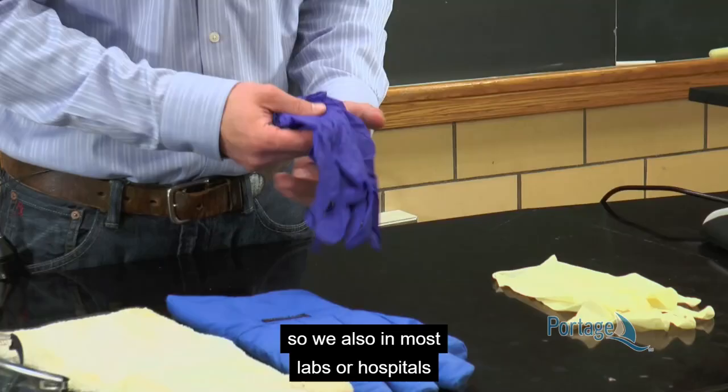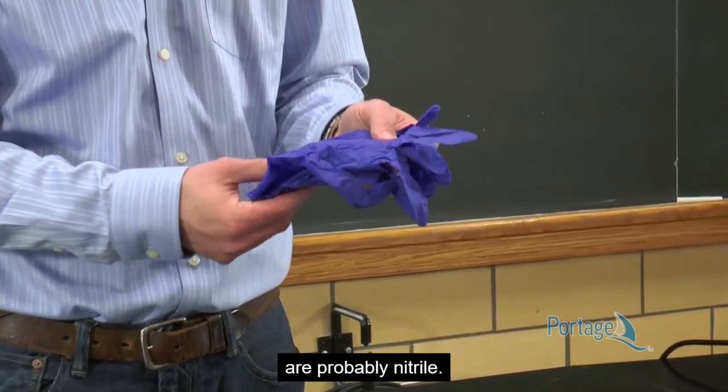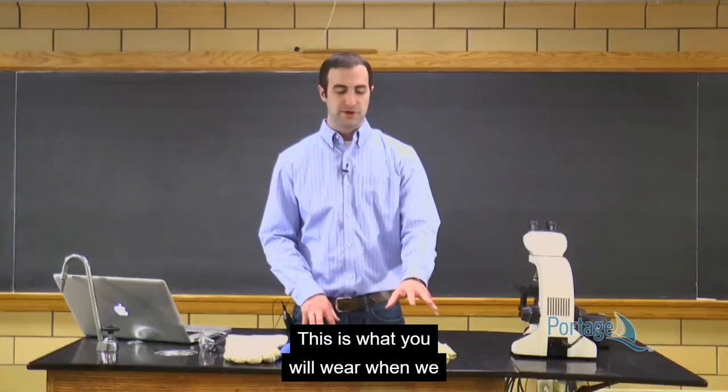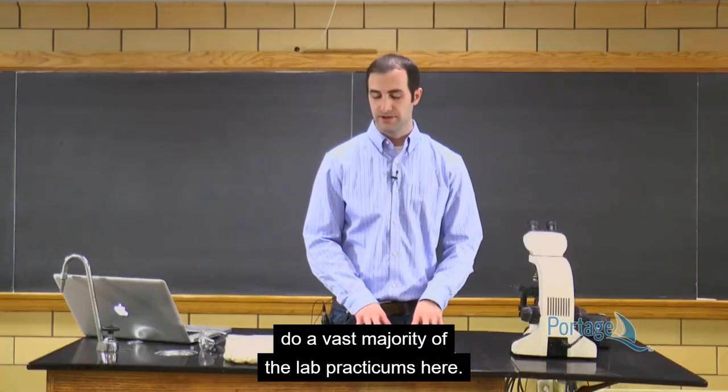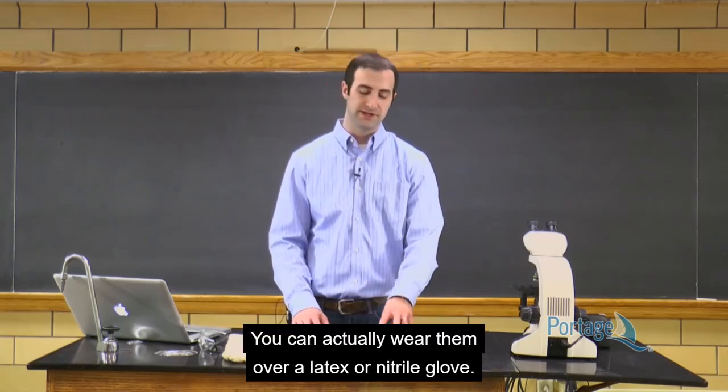So we also, in most labs or hospitals, will offer a nitrile alternative. Most gloves that are either purple, blue, or green are probably nitrile. They obviously contain no latex and are very hypoallergenic. This is what you will wear when we do a vast majority of the lab practicums here. There are also 2 more additional gloves you can wear. You can actually wear them over a latex or nitrile glove.